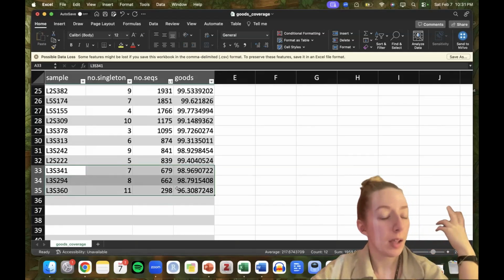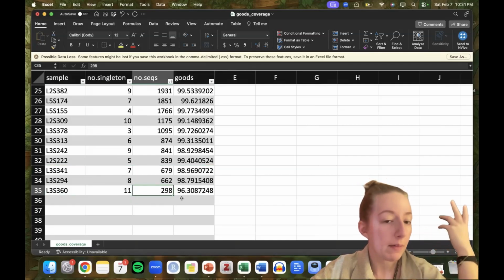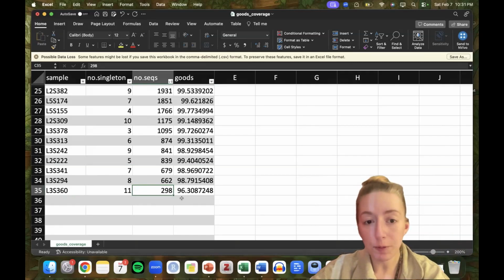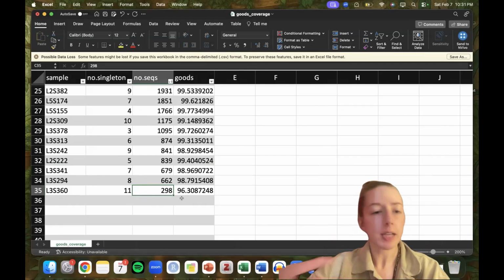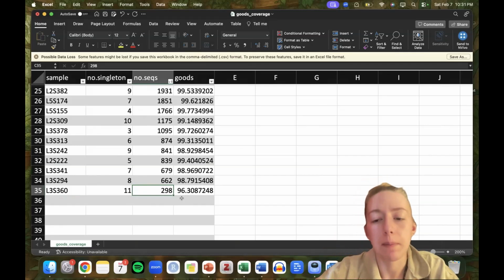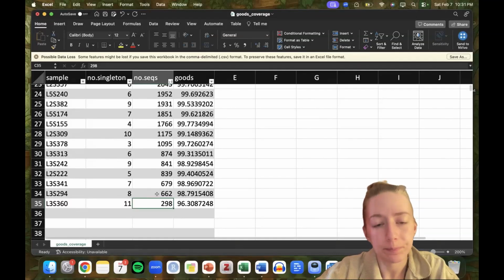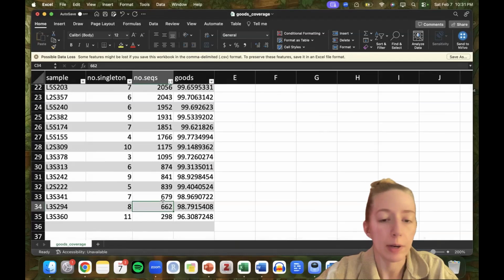If these samples matter a lot, what that means is if you want to keep them, you're going to have to rarefy everything down to 298 reads. That's going to remove a lot of data, but for alpha diversity, that would be an important step to do. So in other downstream analyses that you do, maybe rarefying isn't appropriate, right? And so you wouldn't have to do it. But in alpha diversity, it would be highly recommended.